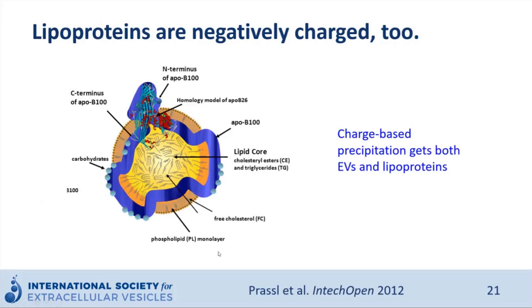However, nearly all lipoproteins are negatively charged. Lipoproteins have a phospholipid monolayer in their structure. The neutralization with either protamine or sodium acetate will also cause lipoproteins to aggregate. Thus, this strategy suffers from severe co-isolating contamination too.